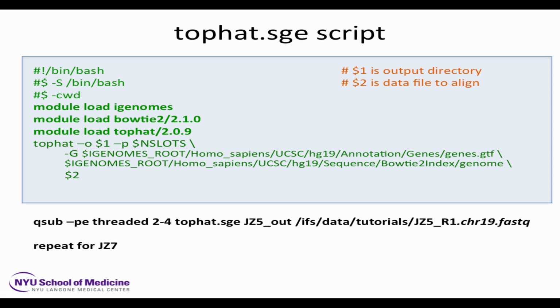There's long non-coding RNA, there's RNA editing that can mess up the bases so that they don't align sufficiently well for Bowtie to find them matching, and there's just unannotated junk in the genome that we're not going to map very well. Also, there's certain reads that come from, say, insertion sequences, Alus, that map to so many places that Bowtie throws them away. So you never get 97.5% alignment in real data, but that's what you'll get here.